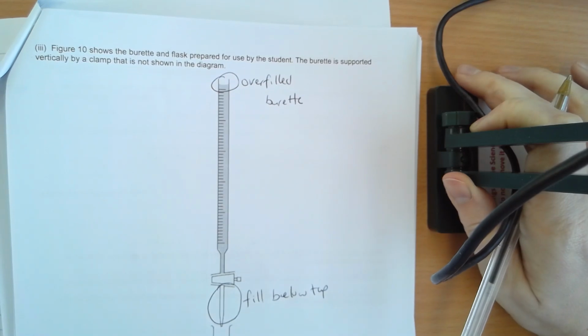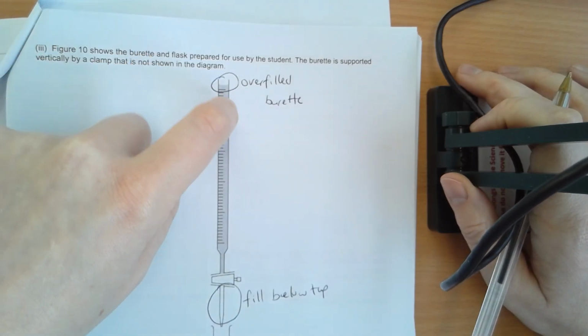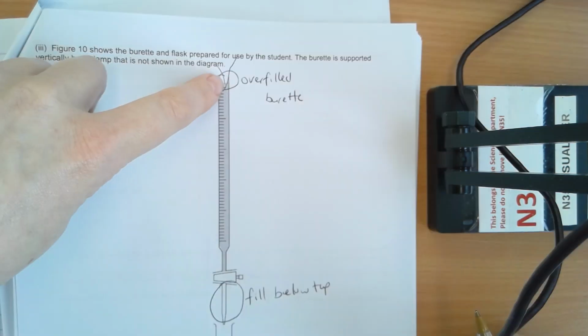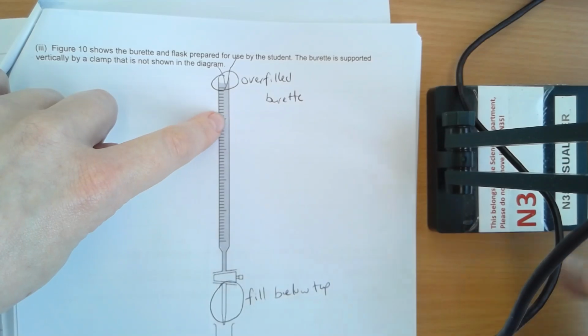Another common mistake people make is they leave the funnel in the burette. You use a funnel when you're filling it, but you have to take the funnel out. So if they had a funnel drawn in there, that would be another mistake. If you leave the funnel in, drops can fall from the funnel and that will interfere with your titer.